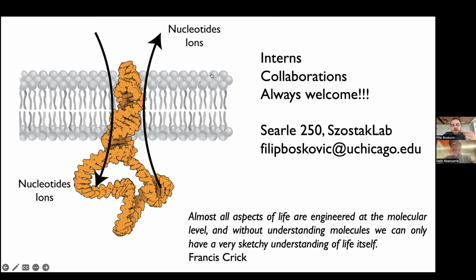So you can also see Zenrun had from their experience that they have a short shelf life. Also, I think you can't measure them for 5 days continuously. Okay, so one flow cell doesn't have that large a lifetime. Although, if you have very long DNA molecules, because the DNA molecule anchors the pores there, it very much depends on your sample.